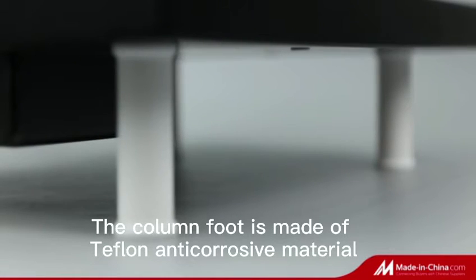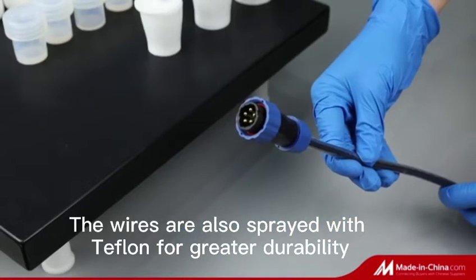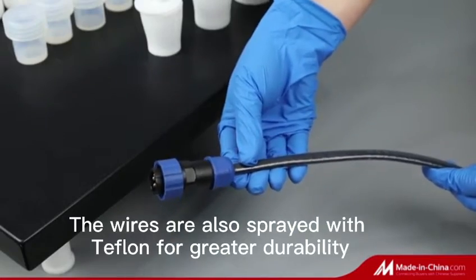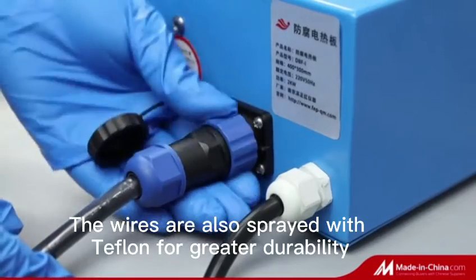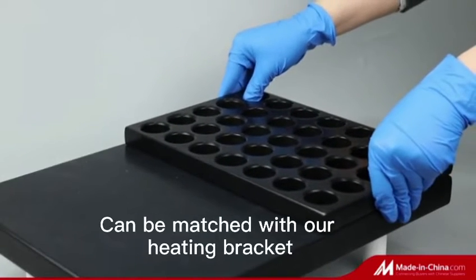We specialize in providing full-process solutions for sample pretreatment for elemental analysis experiments. We have been adhering to the vision of making sample preprocessing no longer difficult, and continue to challenge the minimum background value of trace analysis vessels.